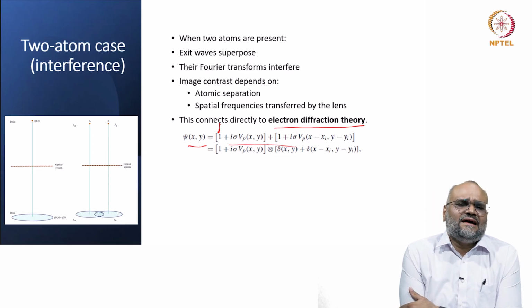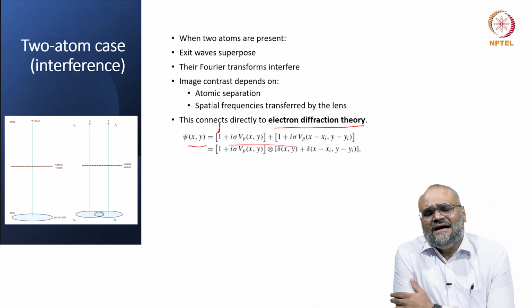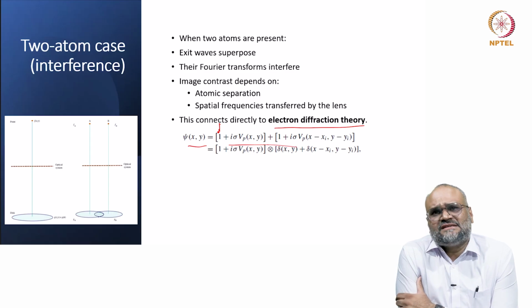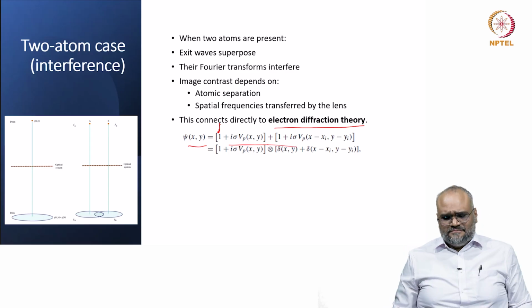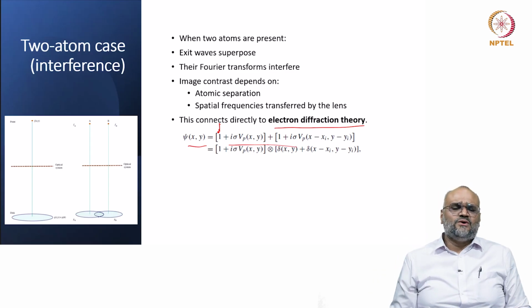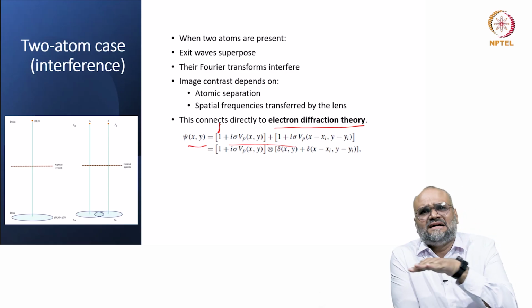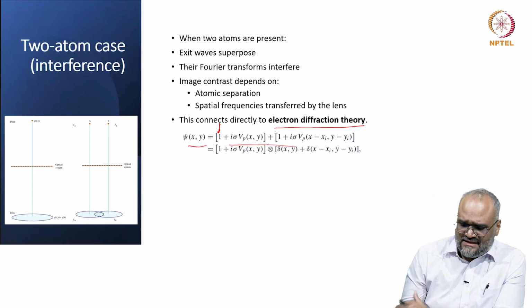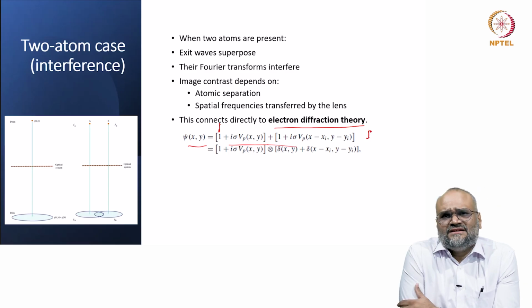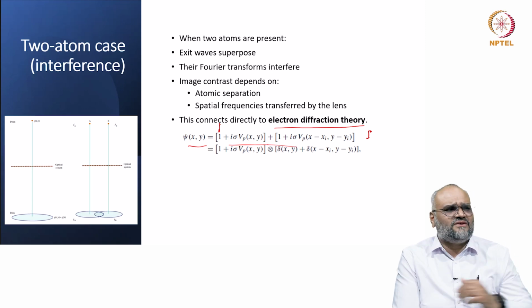The electron wave that interacts with the specimen modulates the phase of the incoming electron beam, and in terms of the spatial positions of the atoms sitting within a crystal, you are varying the electron phase, and you can relate this phase to the potential associated with the positions of the atoms sitting in 2 dimensions. The third dimension of thickness is ignored in this equation. When you take really thin objects, you can always use this kind of approximation, and this is called a weak phase object approximation.